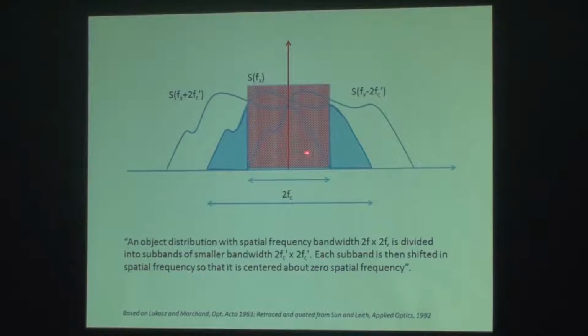And then by shifting the phase grating in a specific direction, I can transform the frequencies you see here into this. Now the area which is not collected in this area is moved into this side, and the frequencies on this side are moved in this direction.